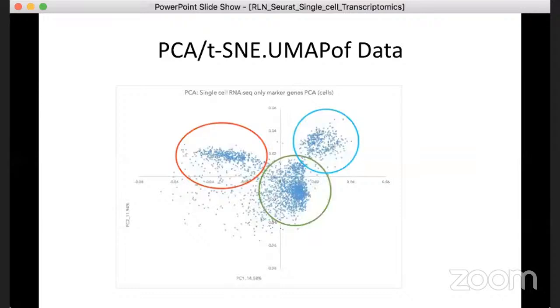These distinct clusters that we can identify, based on the segregation pattern of cells as exhibited in the gene expression table, can be annotated to specific cell types based on the marker genes that we have used so far.